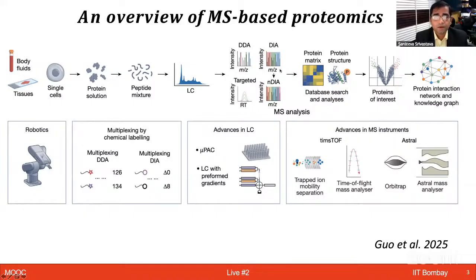So you are now looking at the entire mass and charge window and trying to utilize that information irrespective of looking at only the top end. So this way, your coverage is becoming much broader. Of course, there's a lot of intricacies involved in doing DIA, whether you need to do the library-free approach or library-based approach. How you're going to analyze your data becomes much more challenging in DIA.